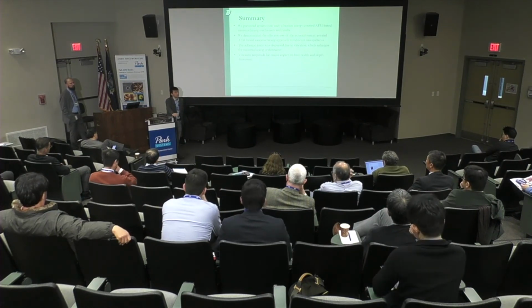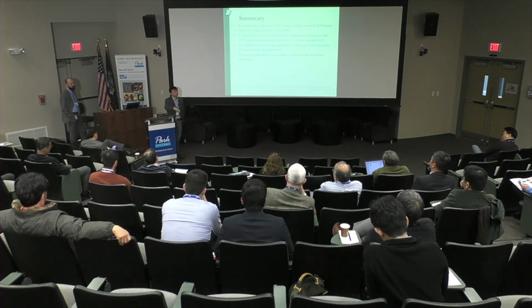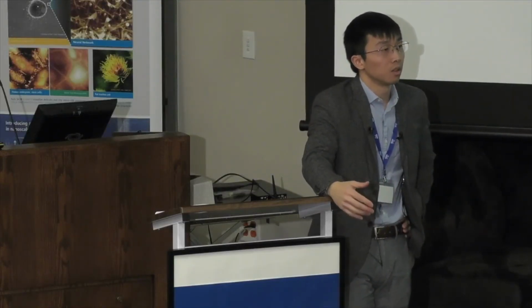For the first question, those patterns you see, the Steve Jobs, the ICE, those 3D patterns, after directly finishing, there's a lot of debris covered on the surface. So we have to do post-processing to wash it away. Currently we use 30% acetone in aqueous solution, mixing acetone with water, with ultrasonic agitation, to wash it away.